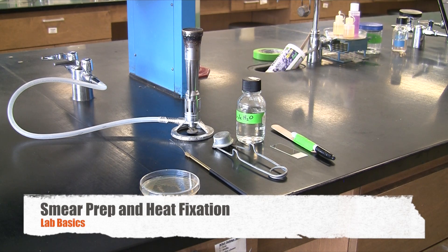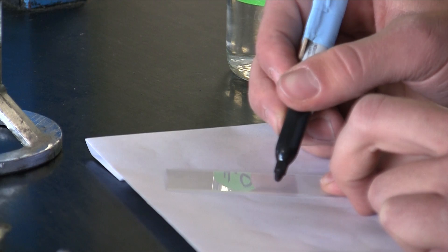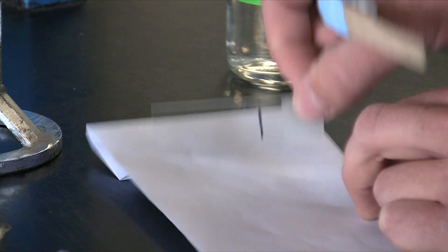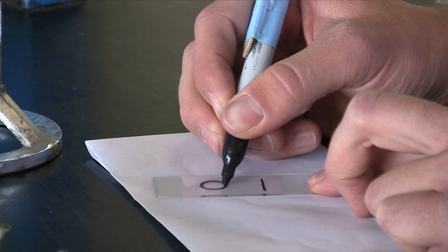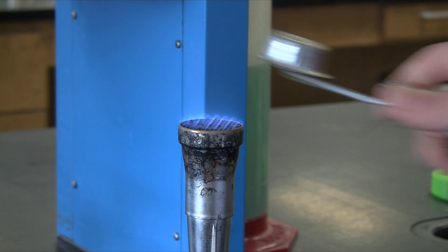A smear preparation is the most important element of getting a good stain. We're going to begin with our slide with the frosted side up. So frosting is always up. Draw a focus line on the front of the slide, and on the back side of the slide you'll want to draw a circle about the size of a nickel to show you where your specimen is.